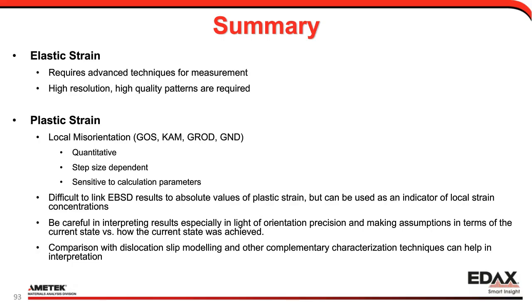It's quantitative. It is step size dependent and sensitive to other calculation parameters. That's something to be aware of. The sensitivity to the calculation parameters I haven't spent a lot of time on here, but it is part of the paper I mentioned. It's difficult to link EBSD results to absolute values of plastic strain. I'll say that right out, but it is very useful as an indicator of local strain concentrations. Where is the strain building up within the microstructure? That kind of picture is what EBSD is great for.